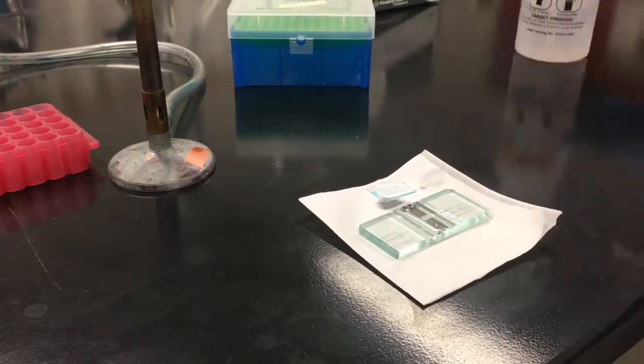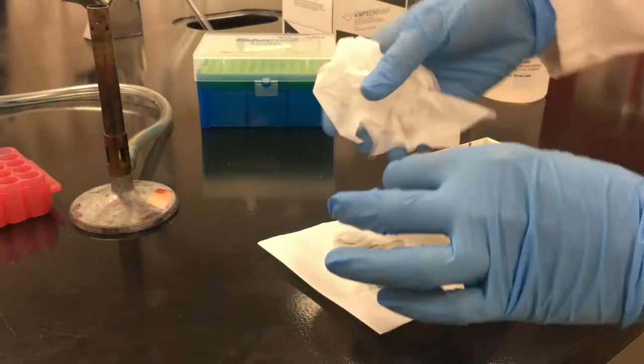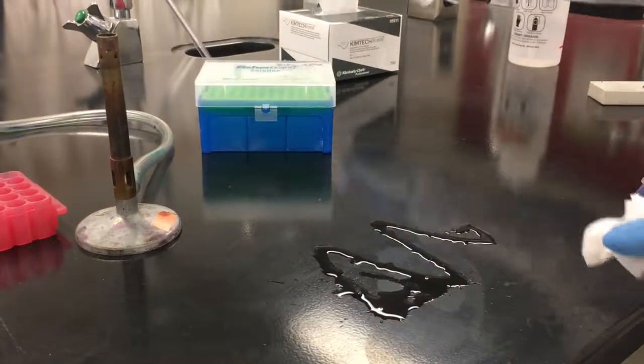Once counting is completed clean the hemocytometer and the cover slip with 70% ethanol and place it back into its box. Clean the surface of your bench with 70% ethanol before leaving.